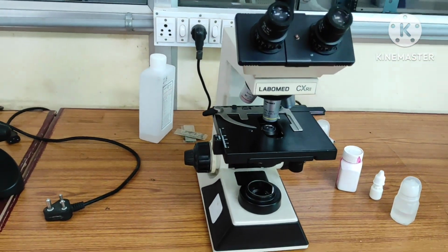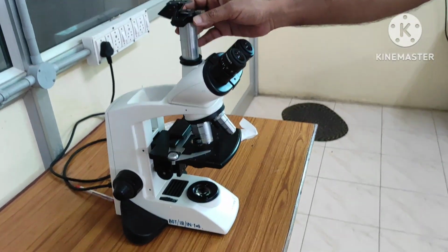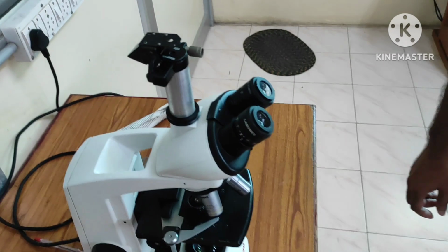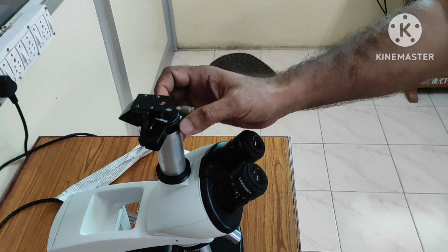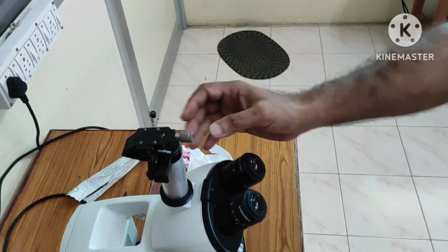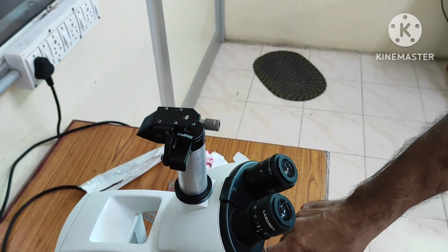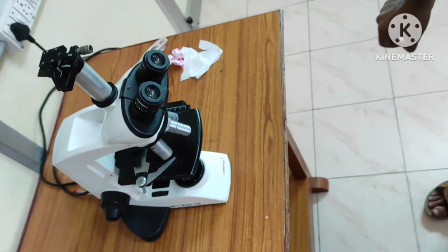This is again one more compound microscope where we have put one another facility, that is called camera lucida. Those students who are in colleges, they may have heard about this word camera lucida, right? What is important here, by use of camera lucida, whatever things we are observing here in our specimen, side by side we can draw the diagram of that also.